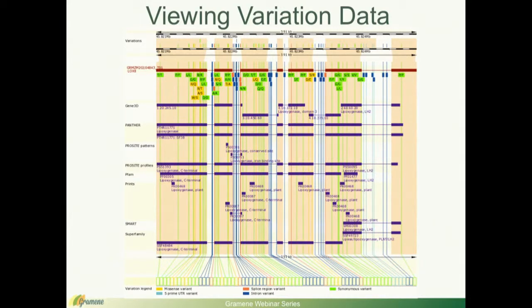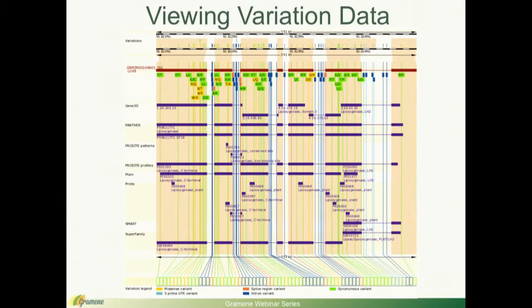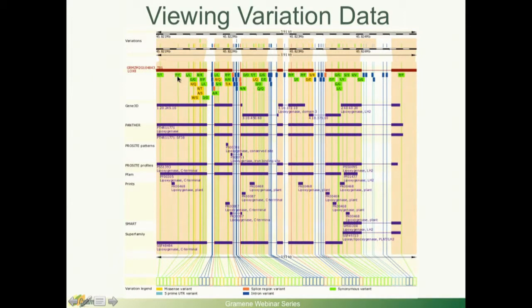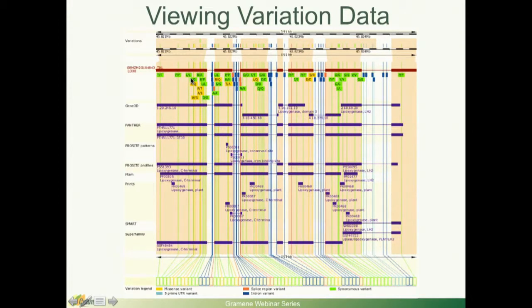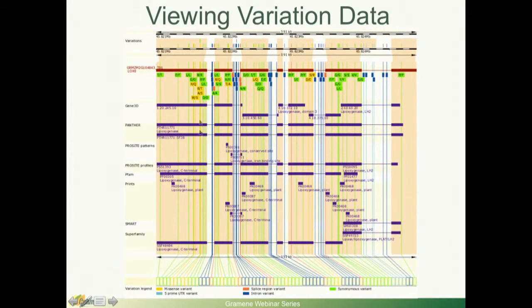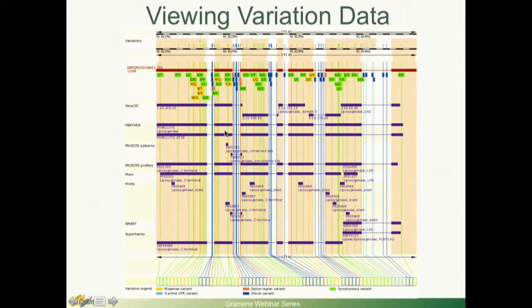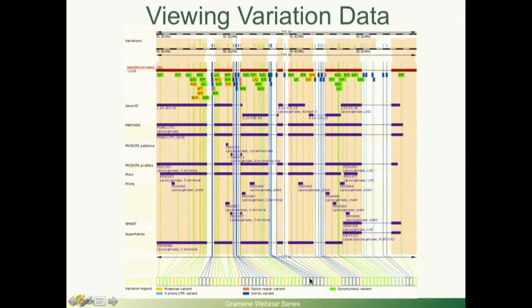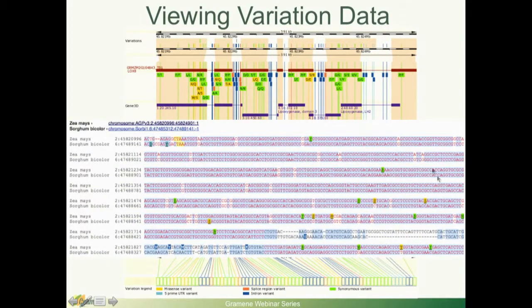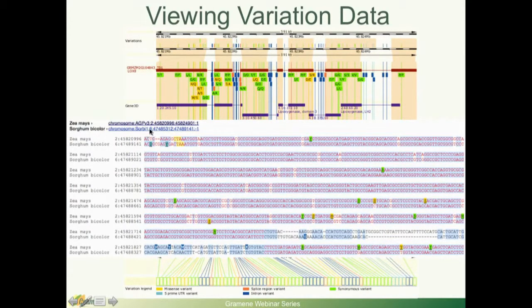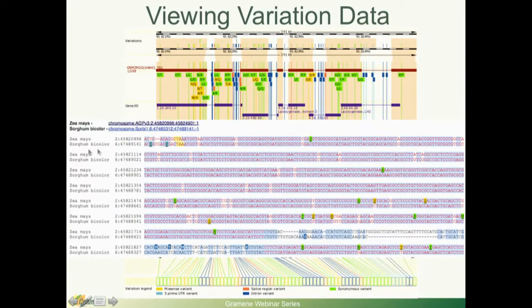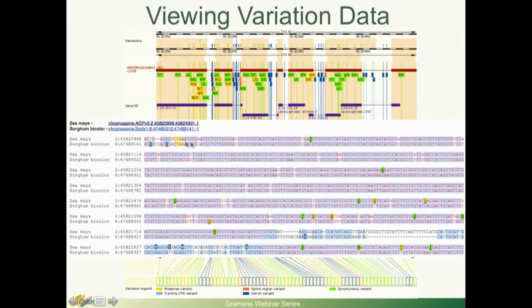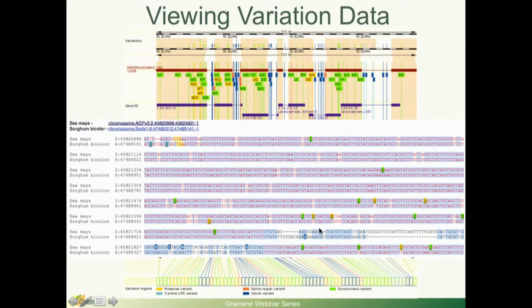Another neat thing that you can do in the browser is view the variation data. In this case, I have that same gene that we've been working with, the LOX8, and you can see the variants color-coded, whether there is an amino acid change also marked, and you can see overlapped with interpro domains. In this case, the more prominent one is the lipoxygenase. You can see these intron-exon boundaries as well. And again, everything is clickable. You can also determine whether there is conservation of your, of this variation. You can have the two species aligned back-to-back and you'll see and you can look for conservation of the new variants.